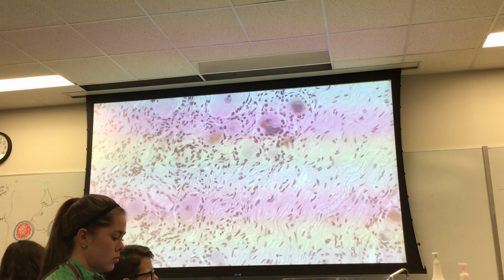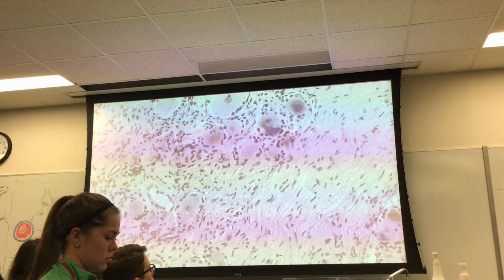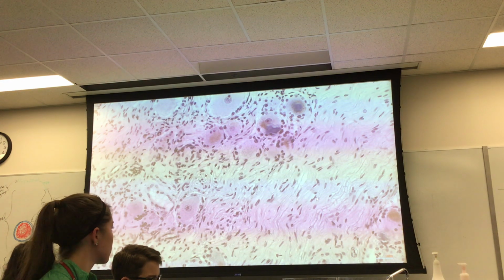So in other words, if this was a sympathetic or parasympathetic ganglion, you wouldn't see that. So, intact layer of satellite cells, centrally placed nuclei, cells of neurons, somas, and fibers are segregated. Definitely that is. And by the way, where is this? This is a dorsal root ganglion.